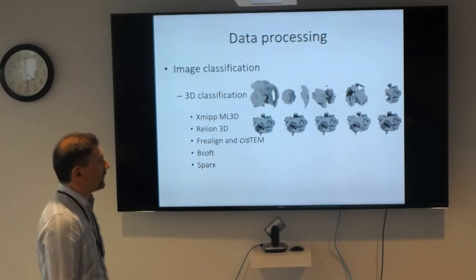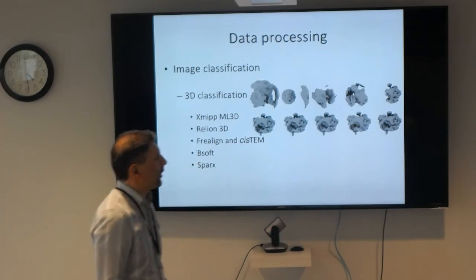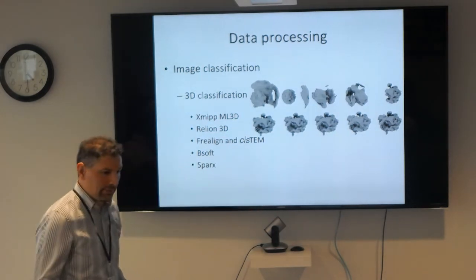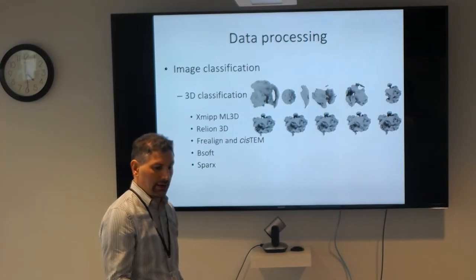So doing the 3D classification will actually clean up the data set, and you start seeing 50S particles. This is from a 70S ribosome. You start seeing 50S, meaning that there's 30S somewhere maybe in the data set or maybe in the ice that you didn't pick and you didn't extract out of it, okay?